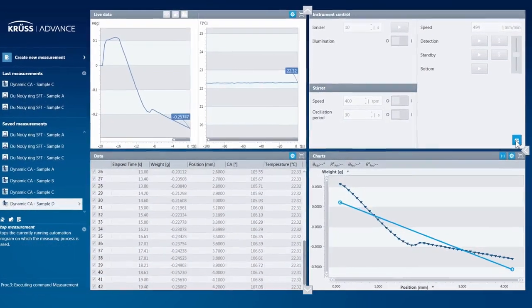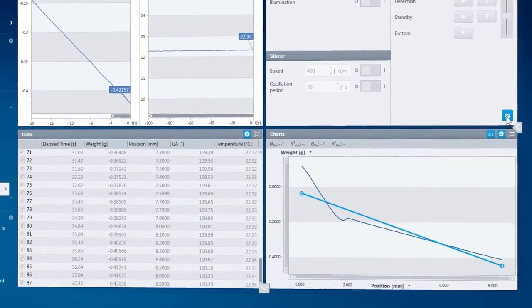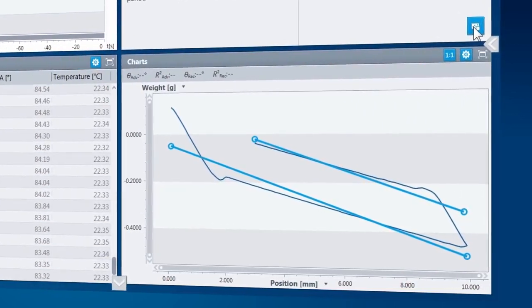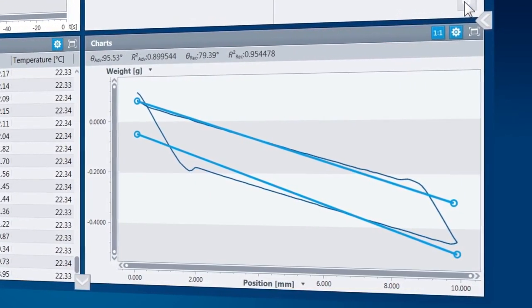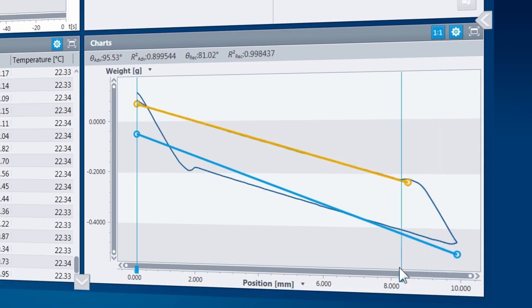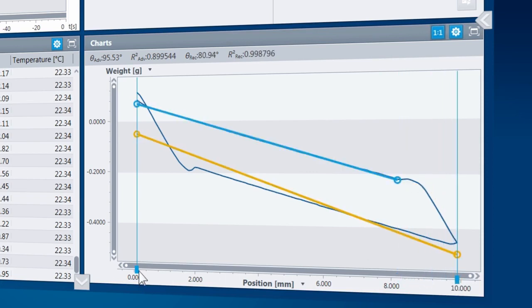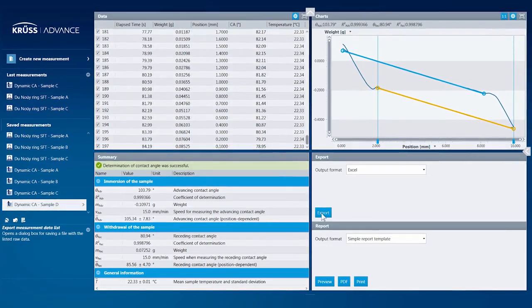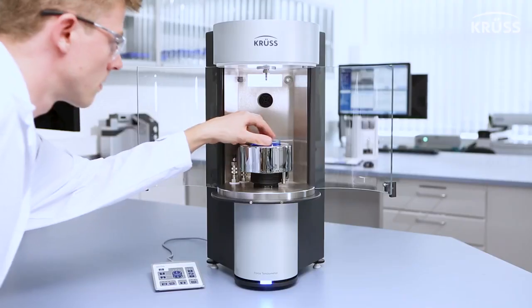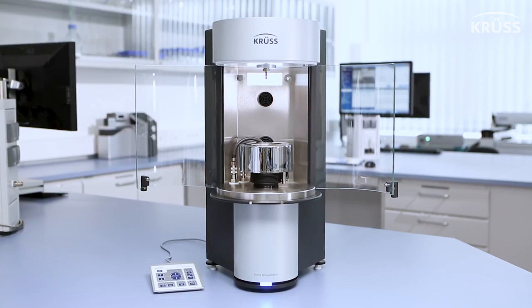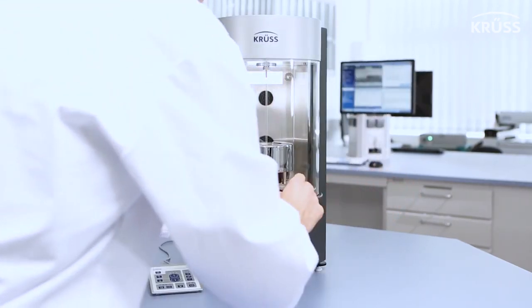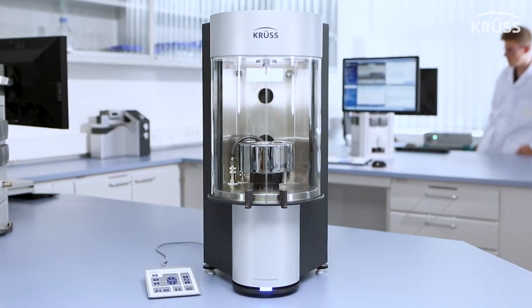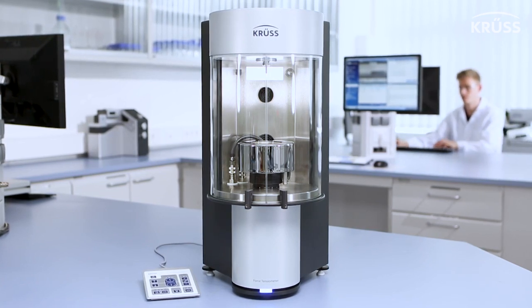Measuring the advancing and receding contact angles gives you the most accurate look at the wetting and de-wetting behavior of your material, defining, for example, liquid repellency. And even after making the measurements, ADVANCE helps you analyze and organize the results with powerful graphical features and automatic data exports. Over 100 years of innovation in the field of surface science has gained us the trust of thousands of the world's leading scientists, and made the KRÜSS K100 the world's number one force tensiometer on the market today.